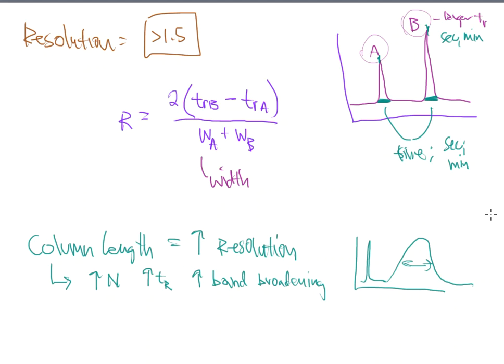And the longer it takes for the molecule to go through, statistically speaking, the more chances of my molecules not coming out at one time, and instead I get this big fat blobby peak that comes off, and I'm really uncertain what's underneath the blobby peak, because there could be other components coming off with it, and that peak is so fat and so wide that it's not going to show me what else is present as the chromatograph is getting recorded. So this is not desirable here.